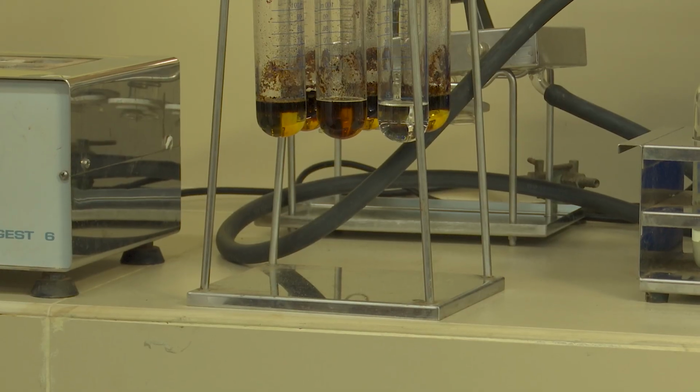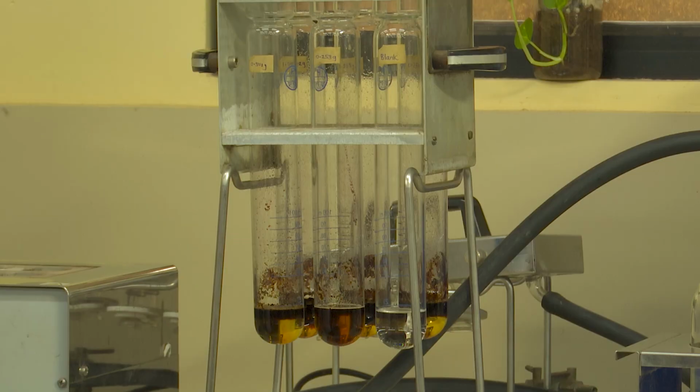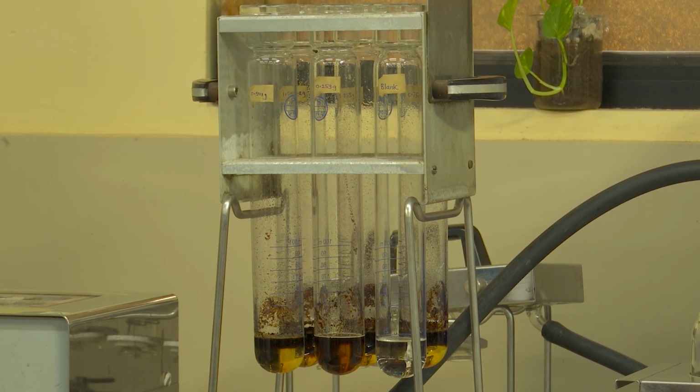In a similar way, you have to weigh accurately 5 different weights of the same solid food sample, and a blank test is required for the Kjeldahl analysis, where, without adding your sample, you add all the reagents into the blank experiment.